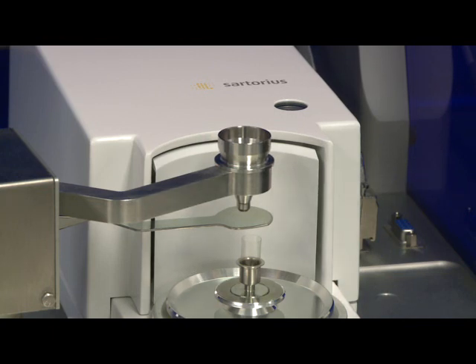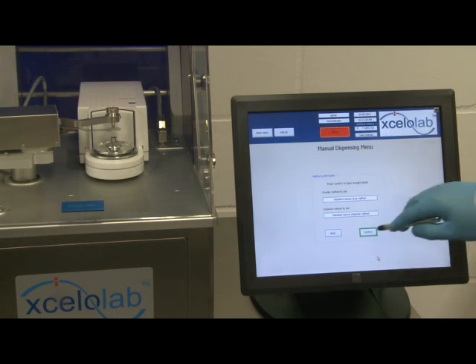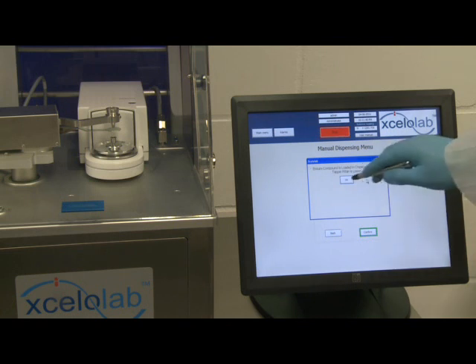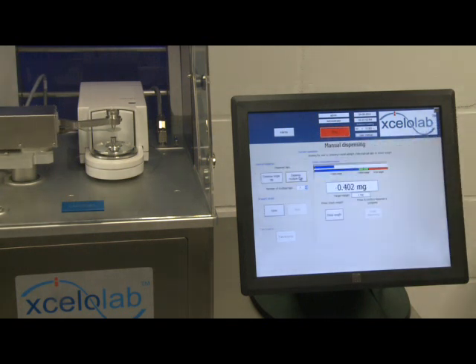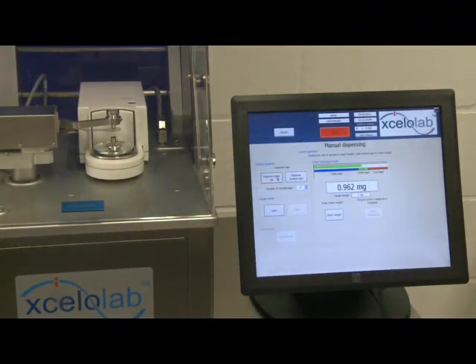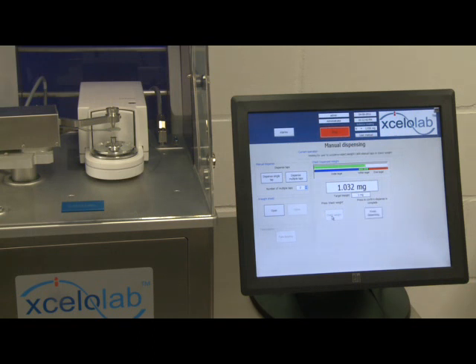The manual dispense mode enables touch screen controlled incremental dispensing. It's possible to dispense small amounts of powder using parameters other than weight — for example, filling a volume or dispensing into a liquid by observing color. The dispensed weight will still be displayed. When performing a fully manual dispense, the automatic operation of the tapper arm and thus the weight estimation algorithm are not used. The manual dispense mode is selected, the powder method and dispense parameters set, and settings confirmed. The operator initiates the dispense by selecting multiple and single taps. The weight is checked at any time and when the required weight is achieved, the dispense is finished.